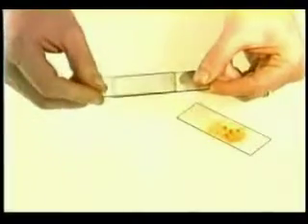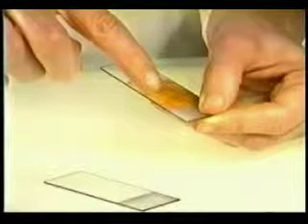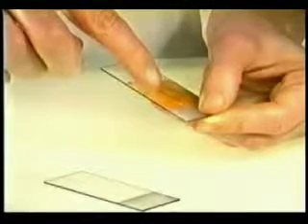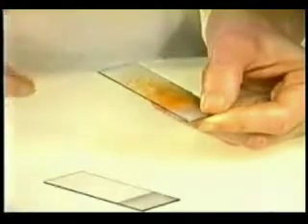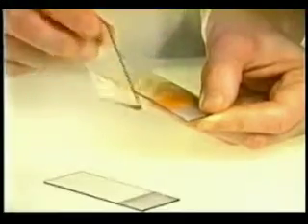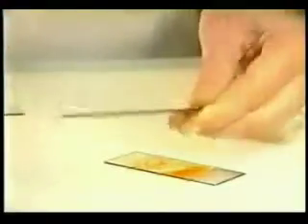Sometimes a few fragments will stick to the short edge of the top slide. In that case, they may be smeared in this fashion. In addition, a few fragments may be left behind close to the frosted end of the slide. If this happens, go ahead first and smear the properly collected fragments. Then, with a short edge of the smearing slide, sweep off the stragglers and smear them in this fashion on a fresh slide.